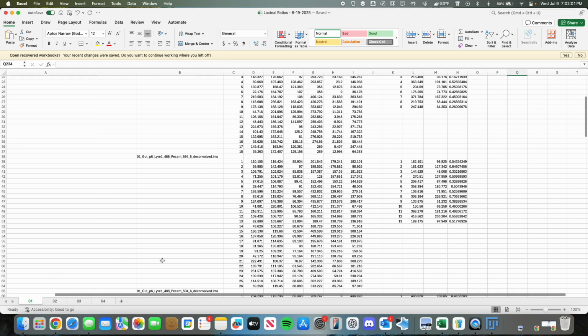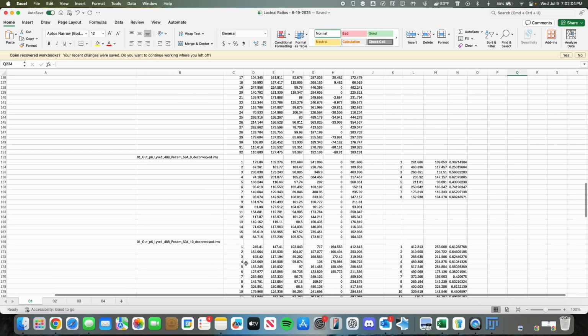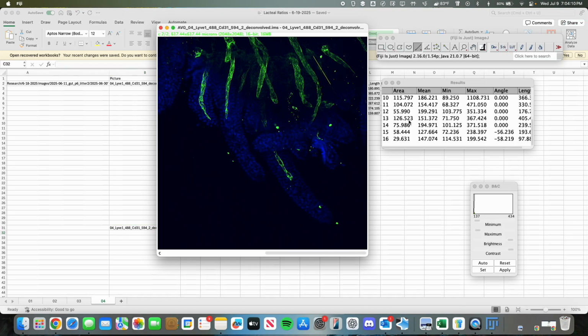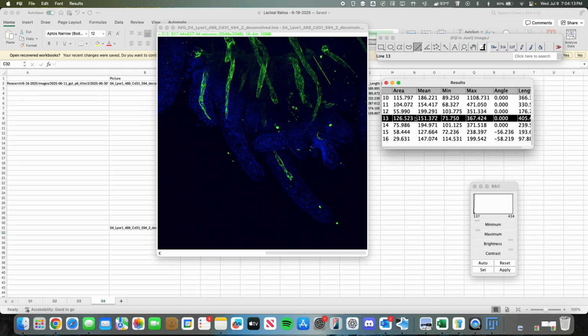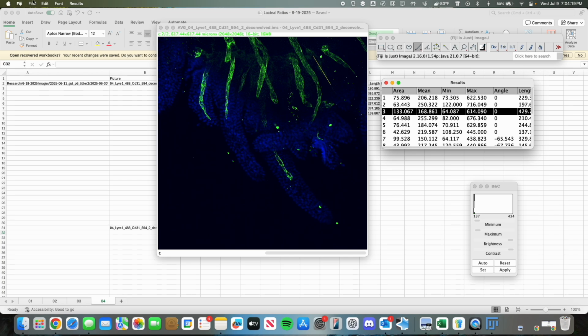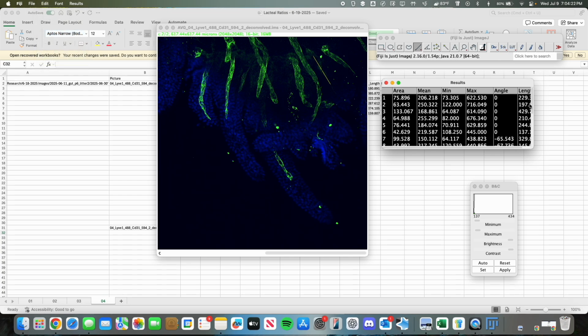And you can see all the names of the files, so we can easily sort through them. We're going to go ahead and press on mouse 4. We have the first one down, and we're just going to paste the name of it. The way I like to organize it is to have a space in between to give the title of the thing. Then we're going to go back to Fiji and press on any one of these values. Then you can do Command A, or hit Edit, Select All, to select everything.